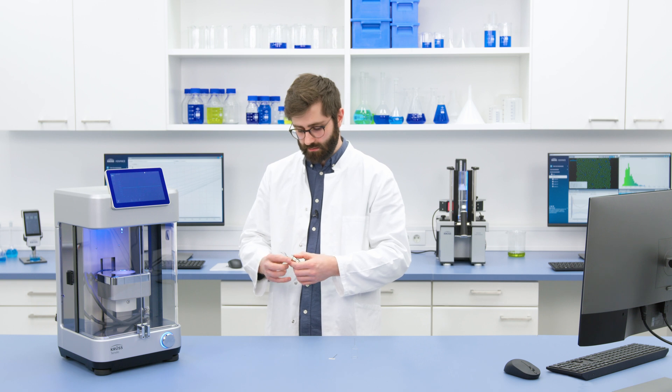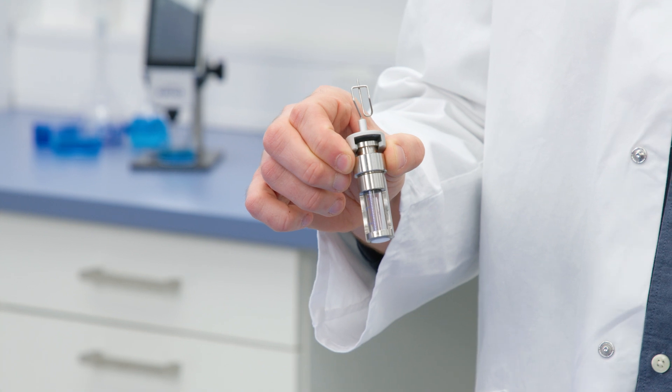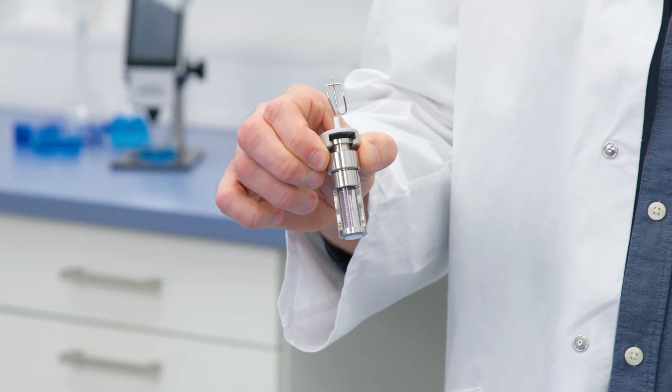So I can take something like this here, which is a Washburn cell, and it's actually used for characterizing the wettability and the dispersibility of powders.